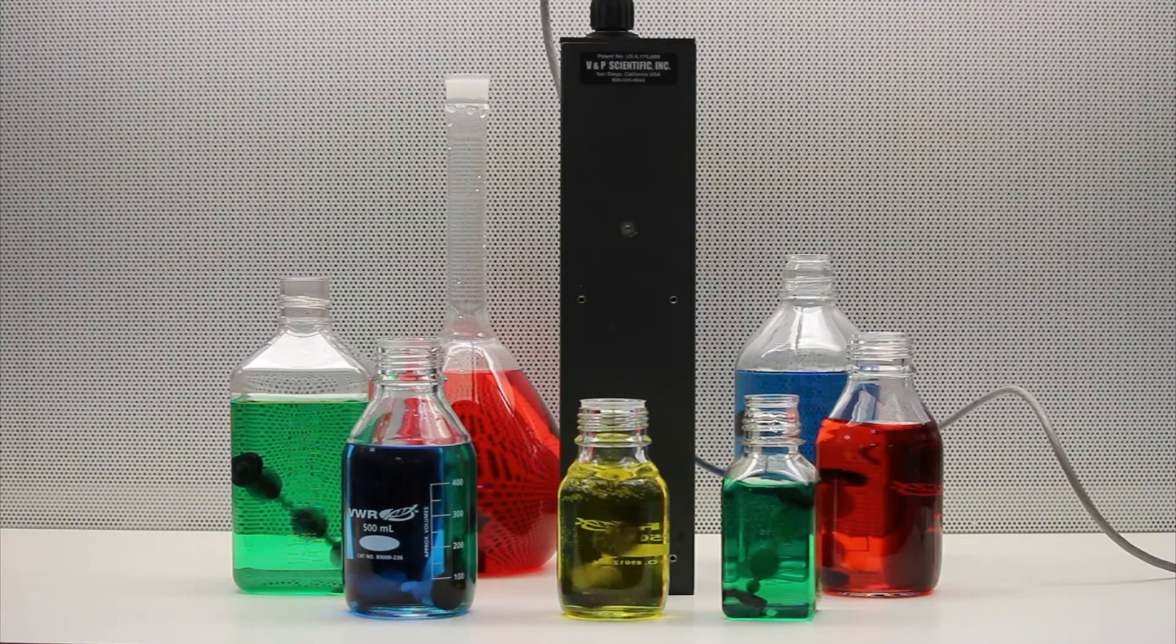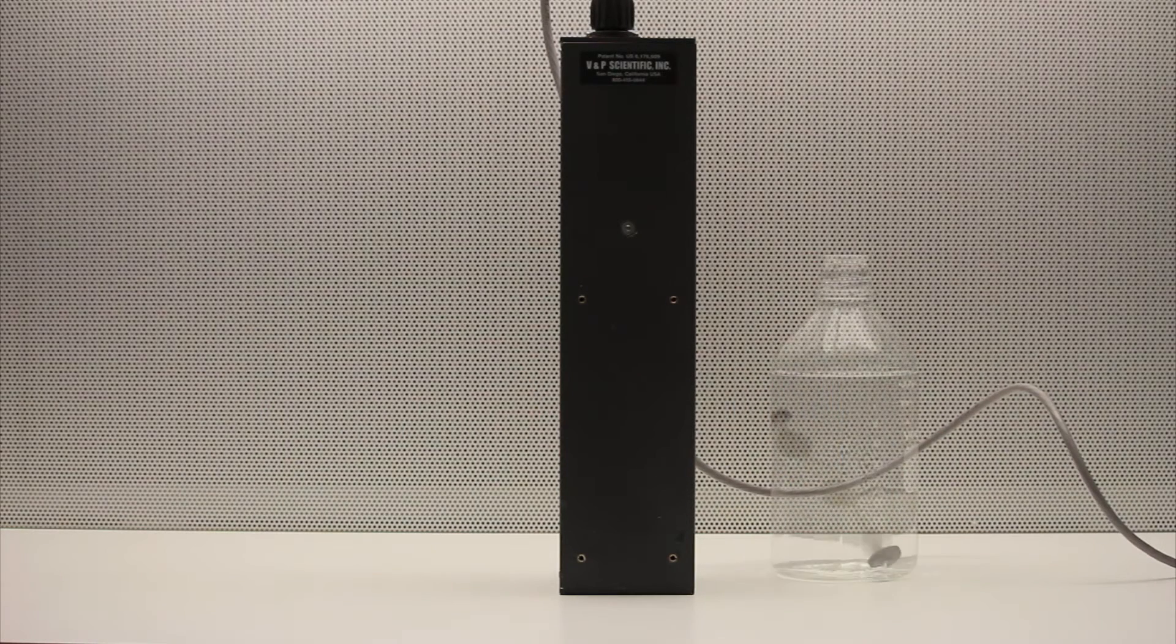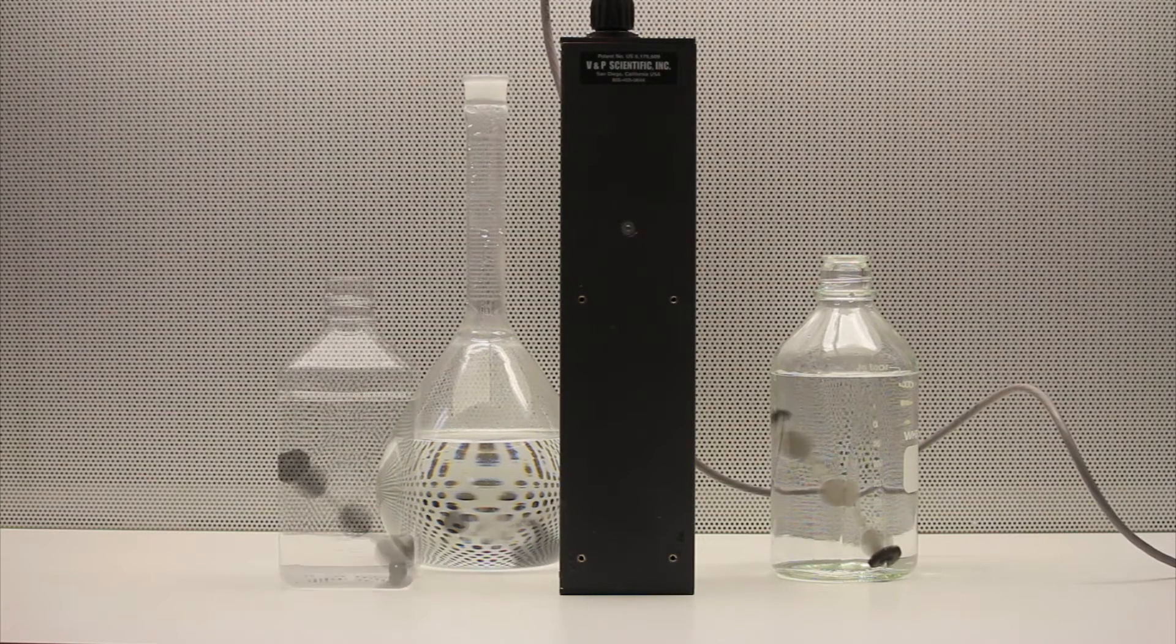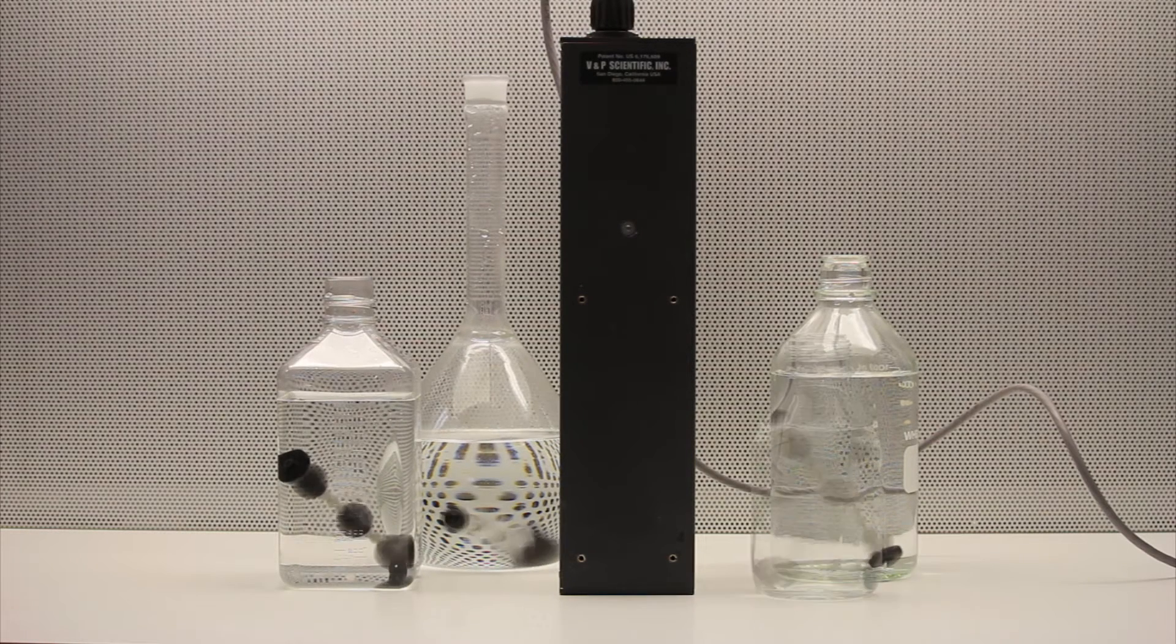V&P Scientific has developed a stirring system to stir multiple bottles at the same time. As you can see, the stirring system allows for multiple bottles, flasks, and beakers to be placed around the stirring device. This will save you time and bench space.